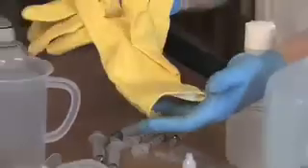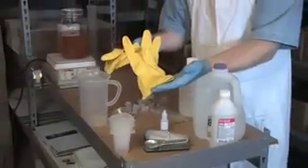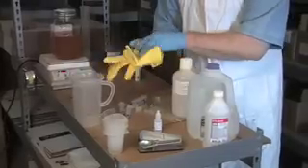I have a little funnel that I like to have around so that I can make my solution up with. I also have some safety gloves. It's important to wear safety garb when you're doing this because you are going to be working with some chemicals, particularly the catalyst, which is either sodium hydroxide or potassium hydroxide.